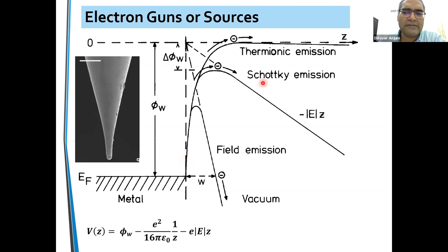But throughout the previous decades, we had been getting it done like this. We still used to call it field emission gun, but it wasn't really a field emission gun. It was having both thermionic and field emission contributions, but we call it Schottky emission.